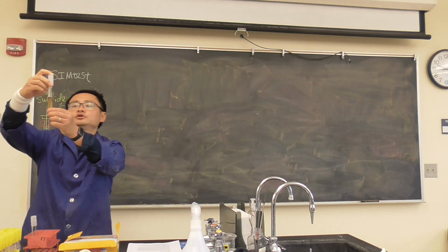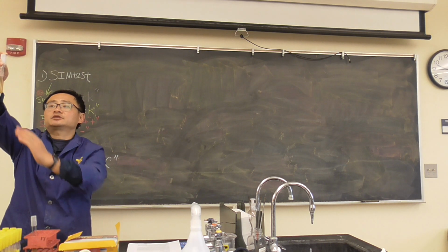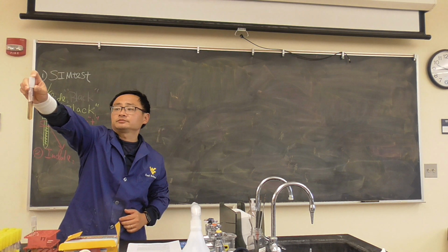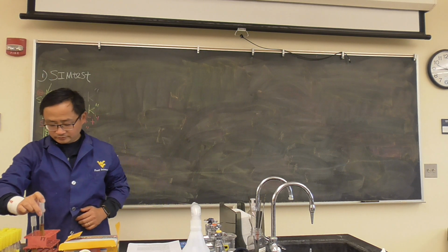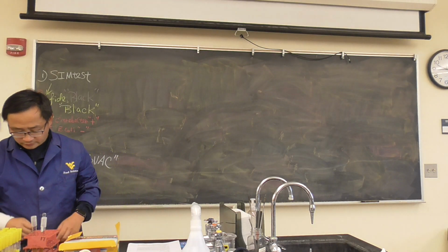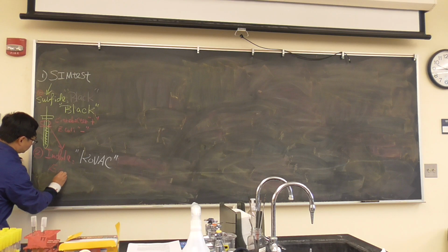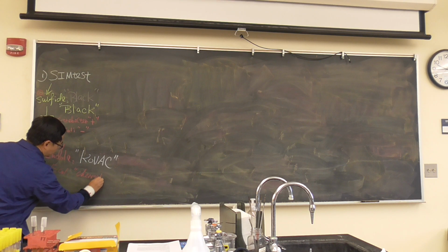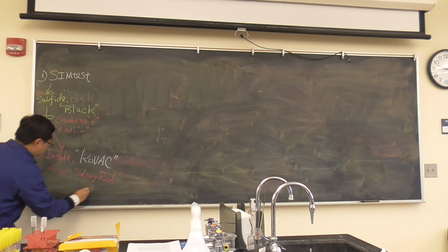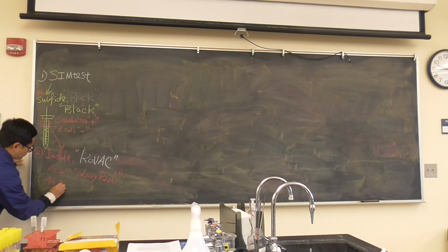By the way, you can see E. coli usually in the middle line. See the big chunk of cluster in the middle line? It started to turn a little bit. Fake cherry red. Okay, so we can say this E. coli is showing cherry red color. It is positive. And this is motility, which is no motility.